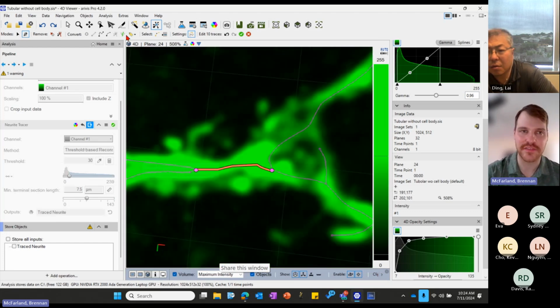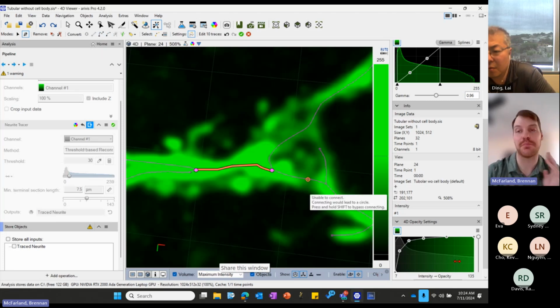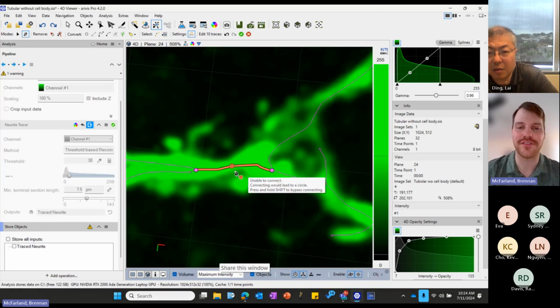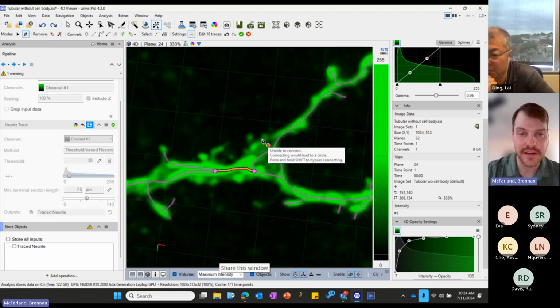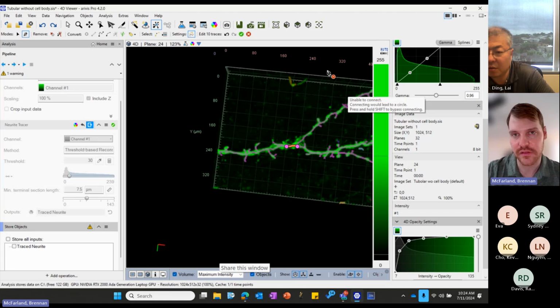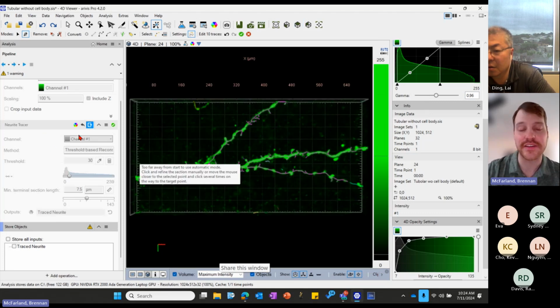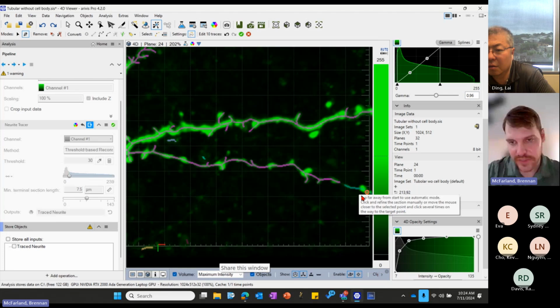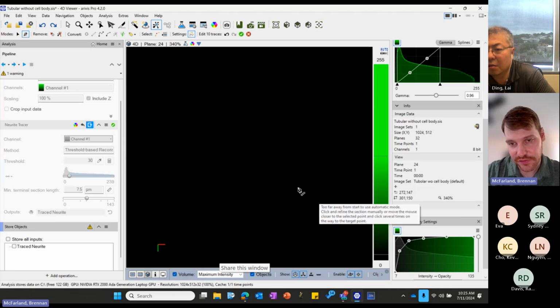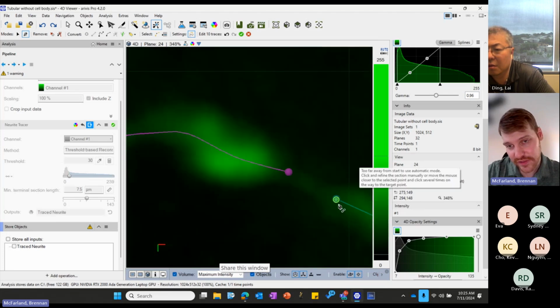You can try and see if doing this simplified connection or refining it can help, but in practice for me, it usually will just change the shape a little bit more, but the nodes aren't going to start connecting into regions that we wouldn't get if we just implemented the function from the get-go. So we can see if that is true here. Maybe it will fix it.